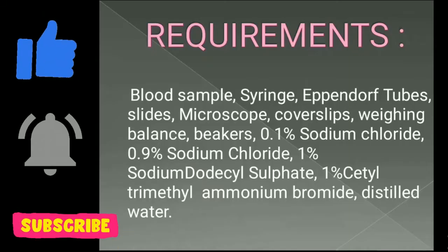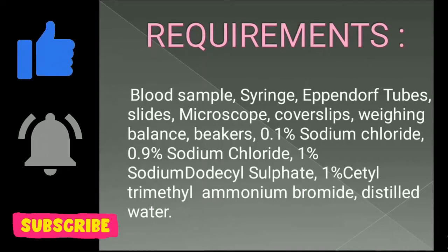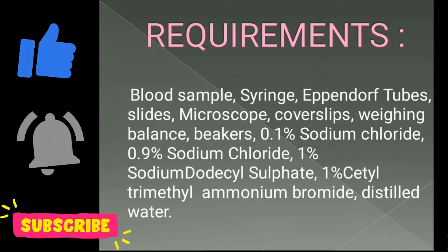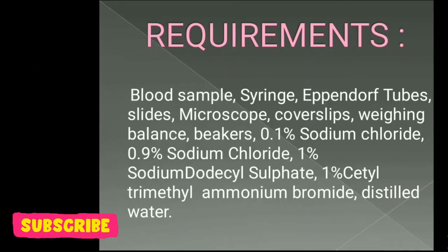The requirements of the experiment are blood sample, syringe, Eppendorf tubes, slides, microscope, cover slips, weighing balance, beakers, 0.1% sodium chloride, 0.9% sodium chloride, 1% sodium dodecyl sulfate, 1% cetyl trimethyl ammonium bromide, and distilled water.